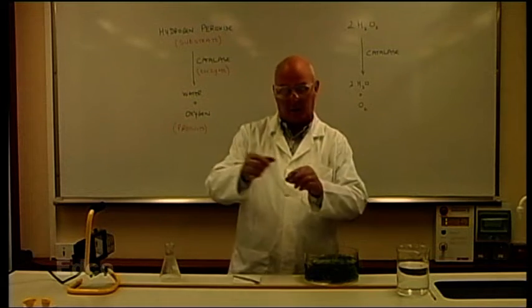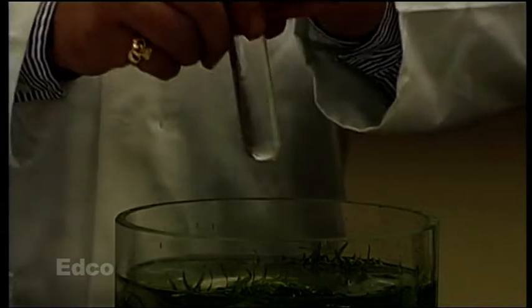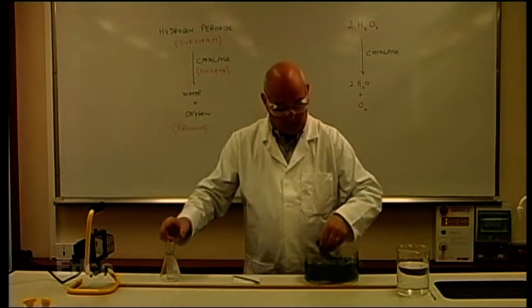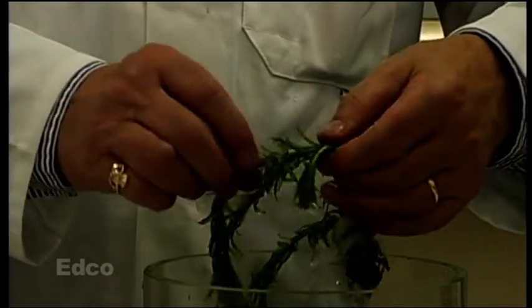First of all, we take a test tube and we take some of the pond water. Elodea wouldn't be comfortable growing in tap water, so we use pond water. And we cut a sprig of the Elodea. Cut a longer sprig than that.